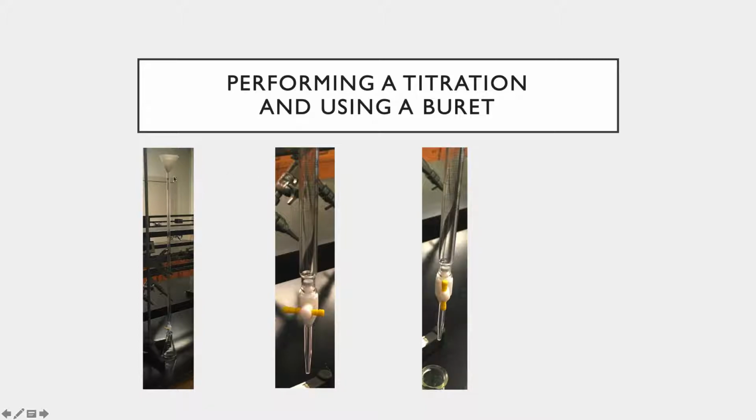As you first start to fill these things, some quick things about the bottom part of the burette: there's a little stopcock that has a knob that can turn. If you see the knob in this position, where it's perpendicular to the glass tube, that's the closed position. That means all of your liquid in this glass tube is not going to pour out the bottom. If it's open, when it's parallel with that tube, that's when you're going to see the liquid actually drain out the bottom. So that's closed, open, and that's how you're going to be adding solutions.